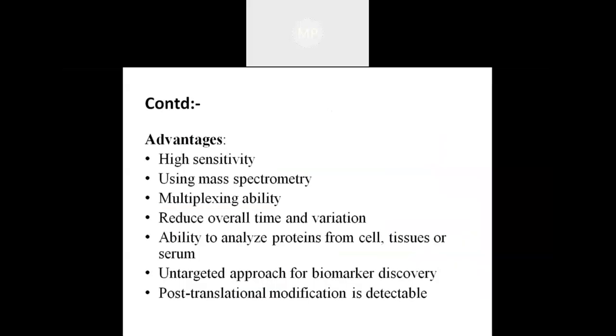The next is the advantages. It has very high sensitivity and it reduces run-to-run variations. It has the ability to analyze proteins from cells, tissues or serum, and it can also detect post-translational modifications.